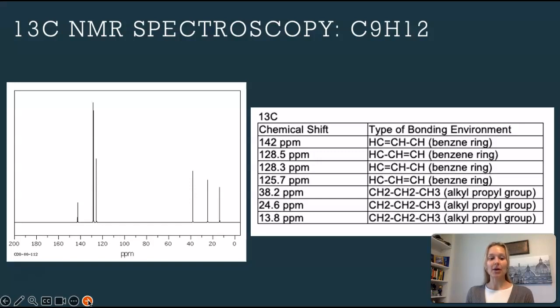These resonances appear as peaks in the NMR spectrum, which then provides information about the types of carbon atoms present and their surroundings. By analyzing the chemical shifts, intensities, and coupling patterns of these peaks, chemists can figure out crucial structural details such as the number and types of carbon atoms, their connectivity, and the presence of certain functional groups. This information is essential for determining the molecular structure and understanding chemical properties and their reactivities.